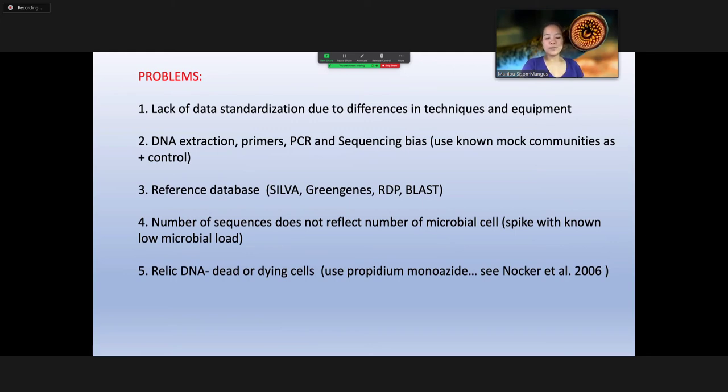And this is one of the reasons why, when we analyze data, some bacteria are isolated but are not found in the sequences. It's because they're not amenable to extraction, or if they were extracted, they were found as rare, and so they tend to be removed from the sequencing or from the analysis. So for DNA extraction, you have to really think about what kit you're going to use and what method you're going to use, and stick with that. Different DNA extraction methods give different profiles for microbiome communities. So we have issues with that.